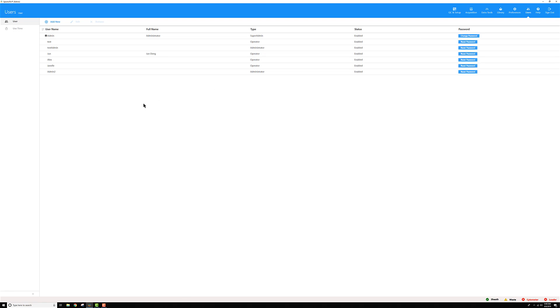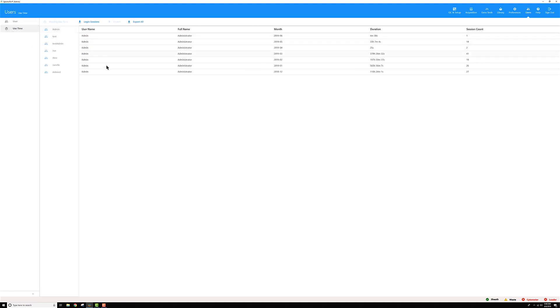Then you have the users menu. So I can see all the users I have. I can reset their passwords. I can look at time. And we'll go into that more in a separate video too.